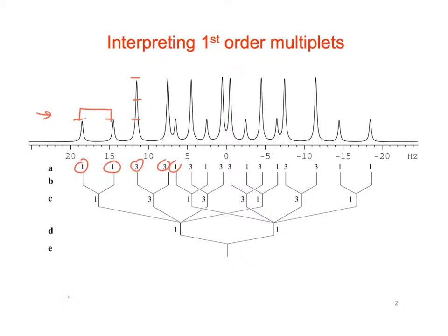And so what we need to do is figure out where those doublets are. We can see another symmetrical one on the other side. We can probably have a doublet here. Sometimes what helps, when I do it on a piece of paper, is that I'll lay a paper down and make a mark on my paper. Then I can slide it across, and I can see exactly which peaks are the same distance apart.